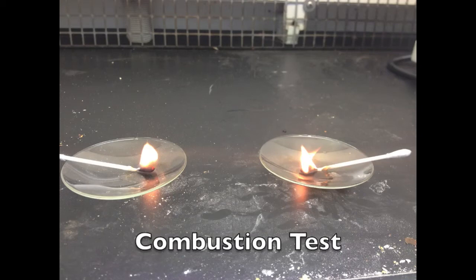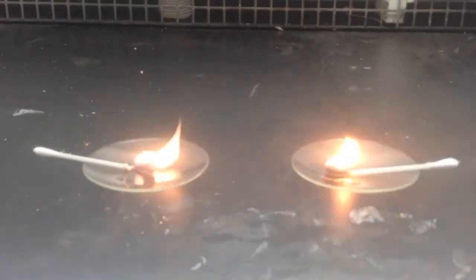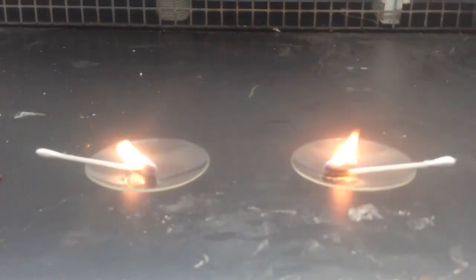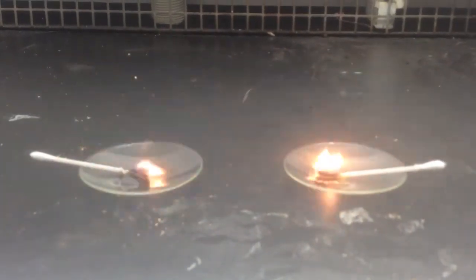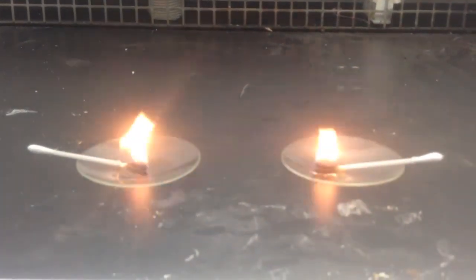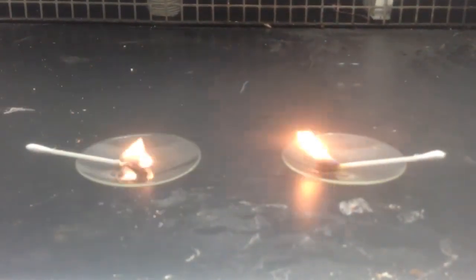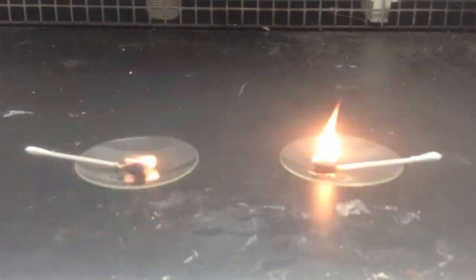Next, you will do a combustion test. Obtain two cotton swabs and dip one into your biodiesel and the other into your starting seed oil. In the fume hood, light the two cotton swabs. Make observations on how long it took to start combustion, the color of the flame, and the presence of soot or particulates formed during combustion. Also record how many seconds it took for each swab to extinguish.